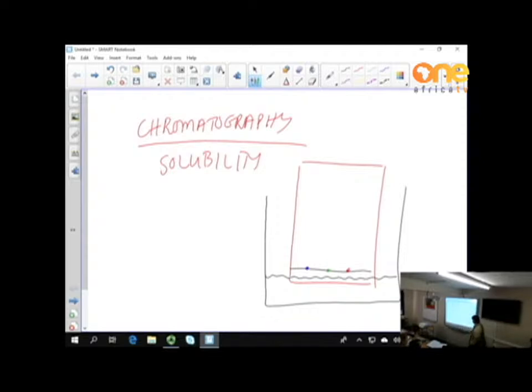We're using water as a solvent, so you can assume that the pigments that we are using are also water soluble. If I use, for example, a permanent Koki, I won't get a result because the permanent ink has a different solvent. But water as a solvent, many of your inks are water soluble. Those are probably all water soluble.